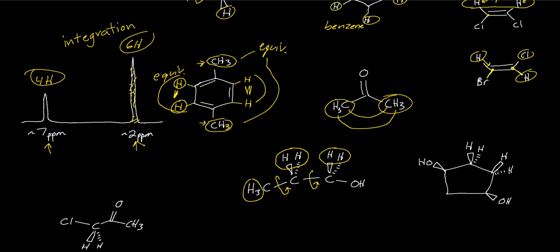The thing I can point out here, though, is that these hydrogens here are not equivalent to these hydrogens here because these are closer to the OH group. So with the spectrum of this molecule, you would expect a 2 hydrogen signal of some sort, and then another 2 hydrogen signal in a different place in the spectrum, and then the 3 hydrogen signal somewhere else. This is not intended to show where they would be.